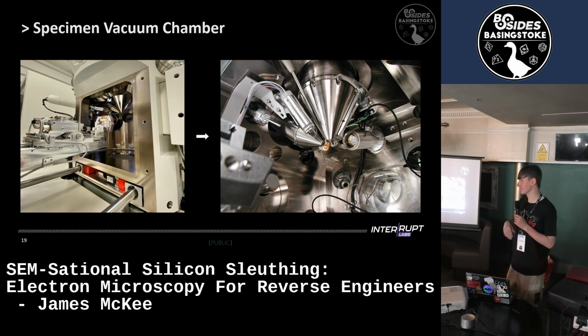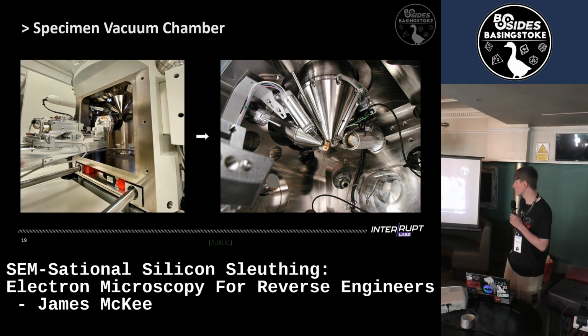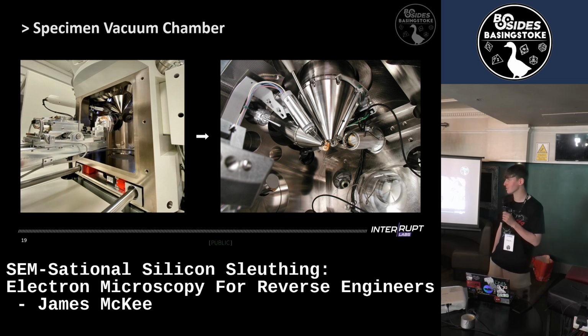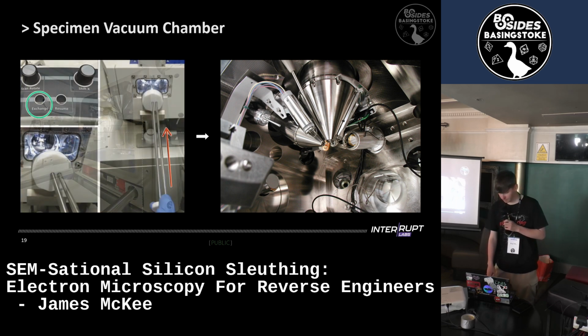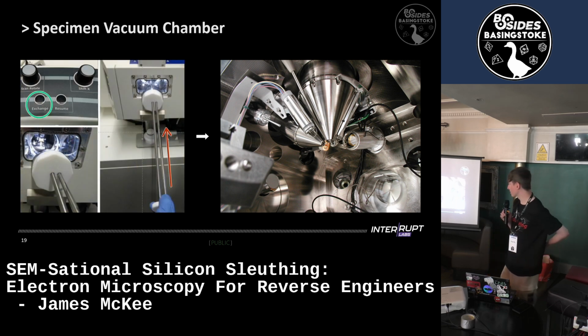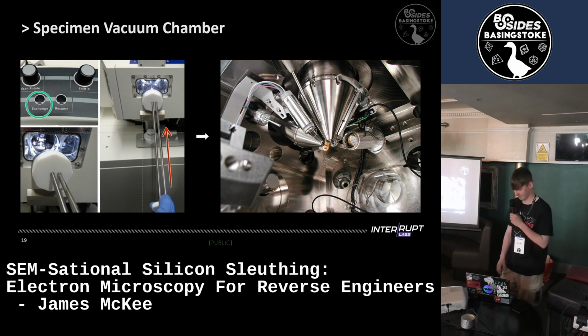Otherwise you'll end up with aberrations or lower ultimate resolution of the SEM. It's being made slightly better these days with sample exchange airlocks like this. You don't have to vent the entire chamber, just a small load lock exchange chamber. That makes the process a lot quicker than the traditional 15-20 minute sample exchange routine.